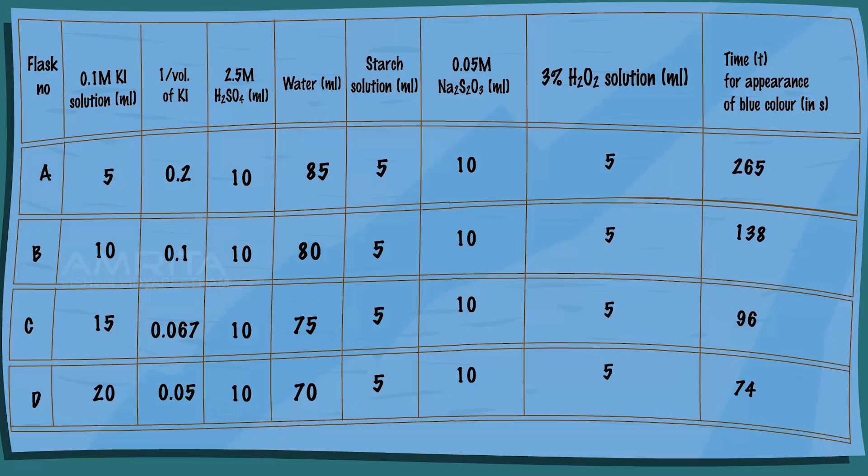Repeat the experiment by adding 5 ml of 3% hydrogen peroxide solution to flasks B, C and D and record the time taken in each case for the blue colour to just appear.